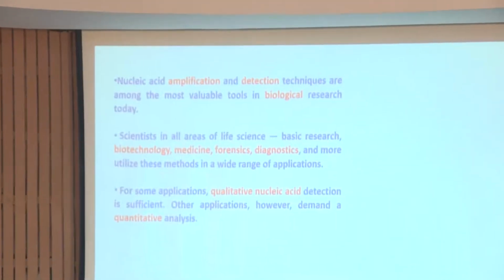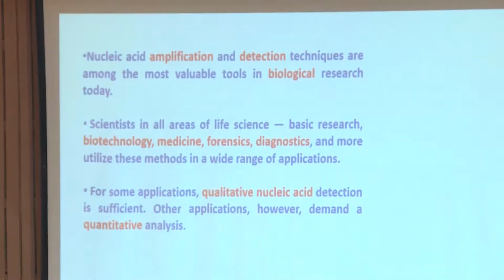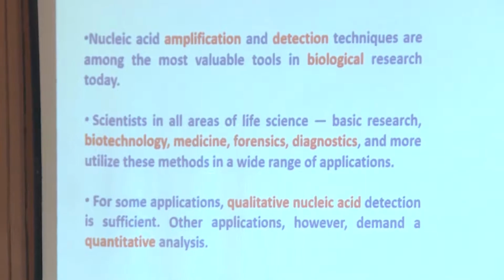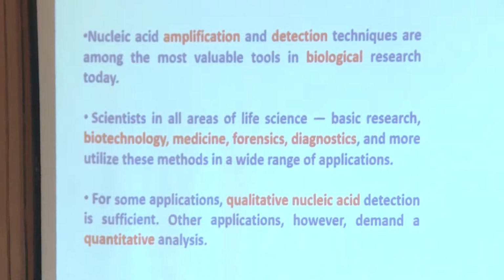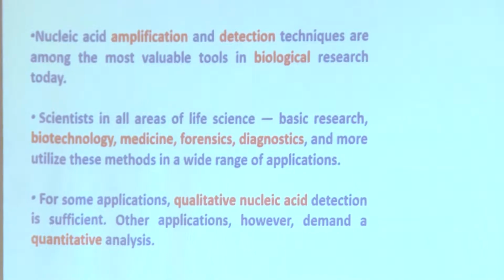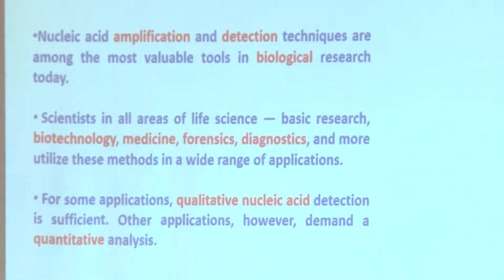But there are experiments, right, especially in genomic science, more precisely in transcriptomic science, where the qualitative results are not what is important. What is more important is the quantitative results. It is not what is getting amplified that matters most; what is more important is how much it is getting amplified.